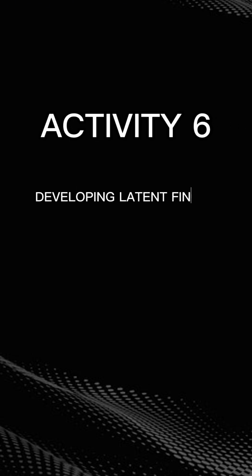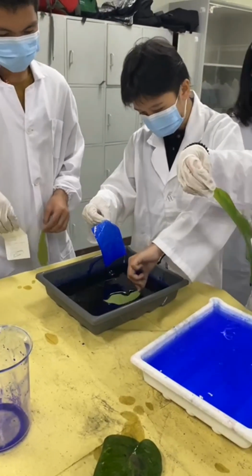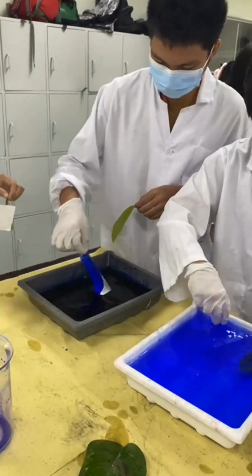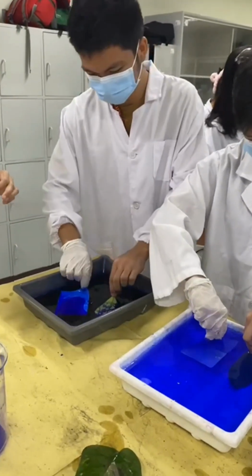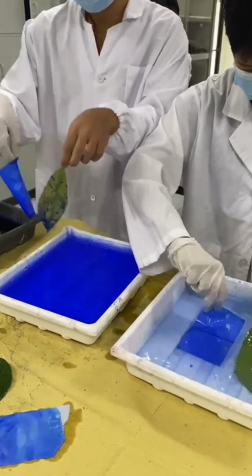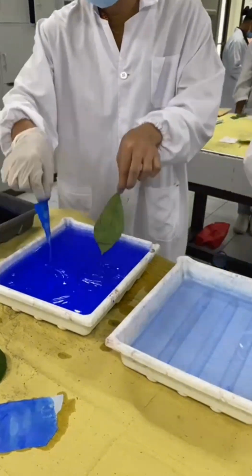Activity 6. Developing latent finger impression, Victoria Blue method. First, a non-porous object is prepared for processing. The surface is handled carefully to avoid introducing new prints. The item is immersed in or carefully swabbed with the Victoria Blue dye solution. This chemical binds to fatty and oily components in the fingerprint residue. After allowing sufficient time for the dye to react, the surface is gently rinsed and dried.